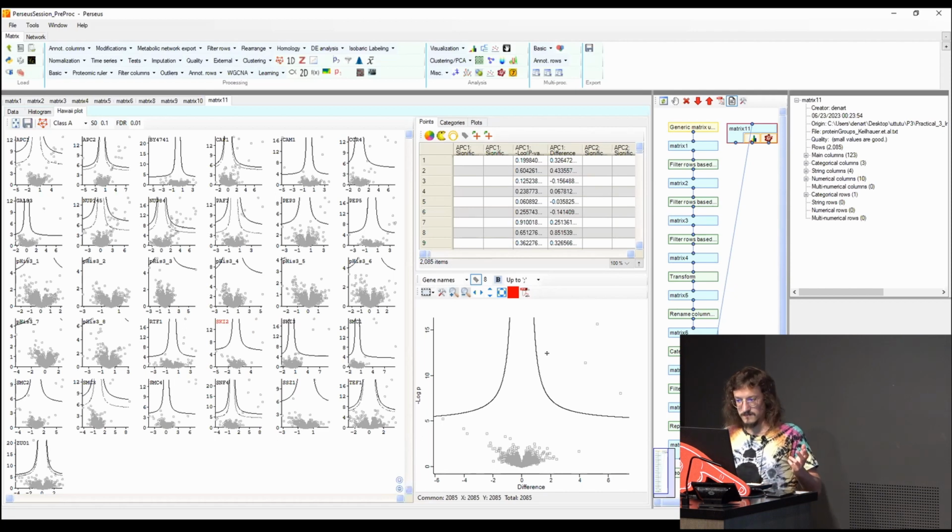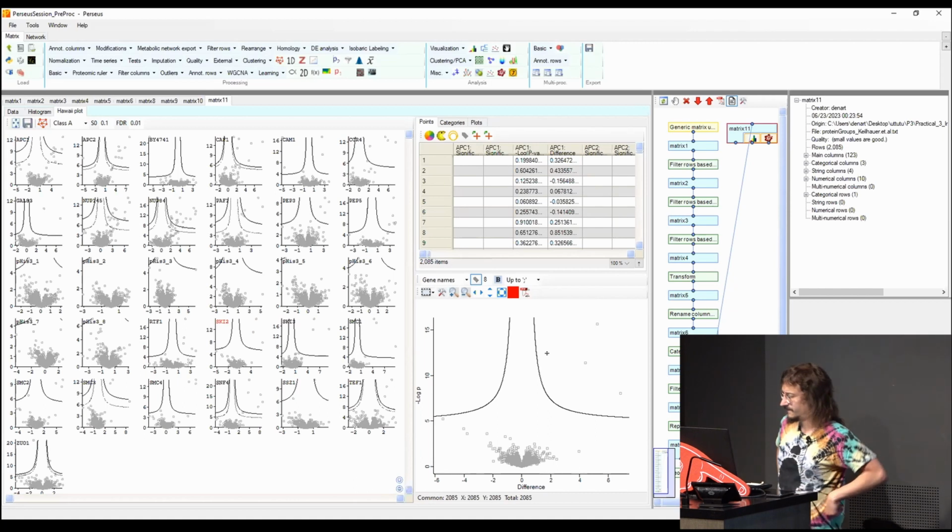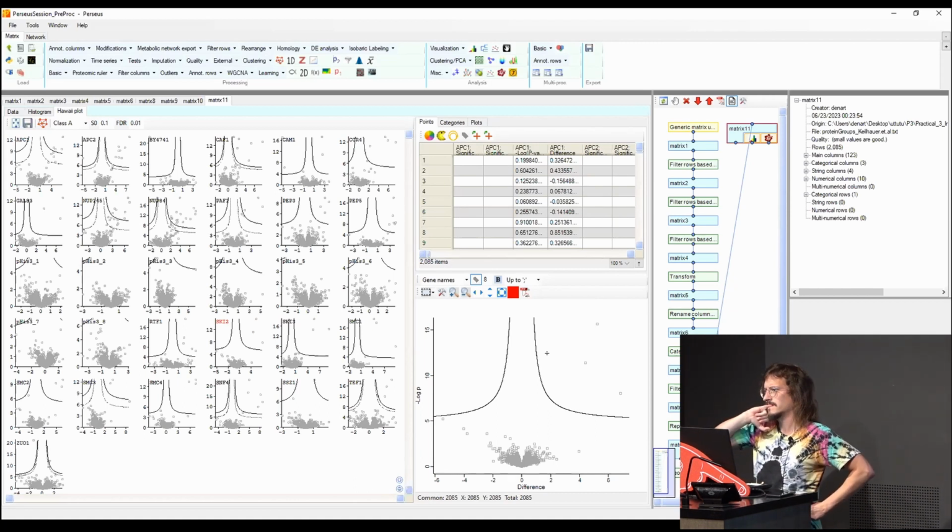But yeah. Carlo, we have a question here. Yes, please. I noticed in your theory slides and also on the examples given in the PDF file and on here that some of the volcano plots have two lines sections. What does that mean? What does it mean if some proteins appear in between the two lines? Could you just explain that, please?